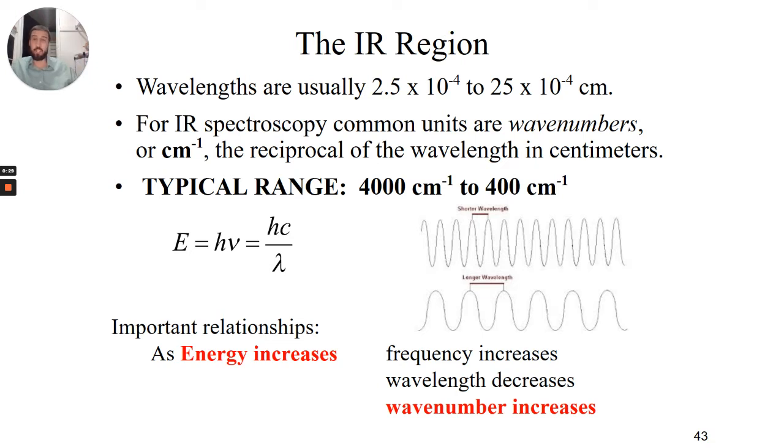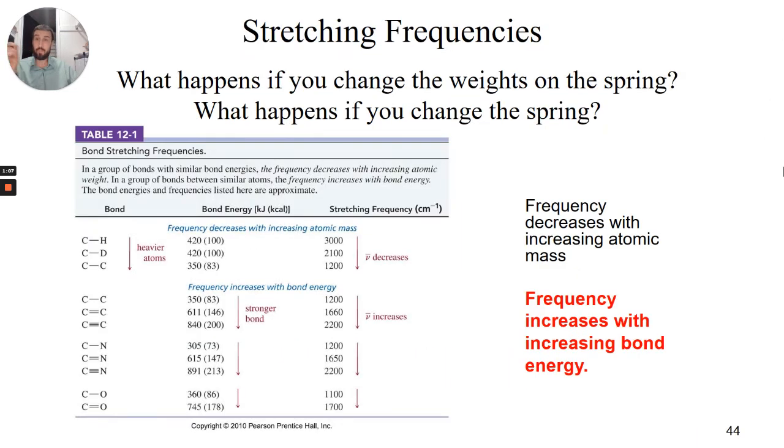And that's ultimately what all these calculations are really talking about: when we look at an IR, the information on that x-axis is our wave number. The wave number is not wavelength, and it's not frequency, but it's related to our wavelength. It's the inverse of the wavelength, and because of that, it's directly proportional to our energy. So the larger values you see, the more energetic that bond, and that becomes useful when we're trying to look at general ranges, which we can see in our stretching frequencies.